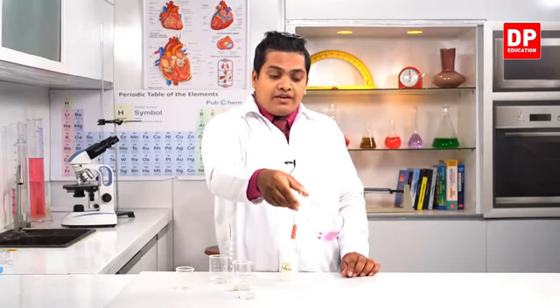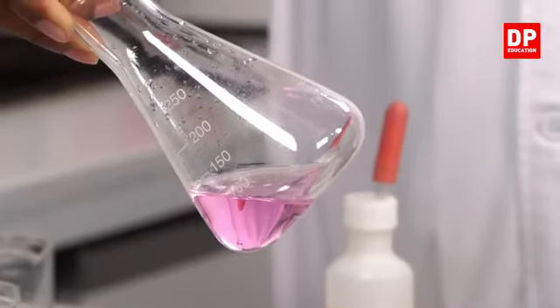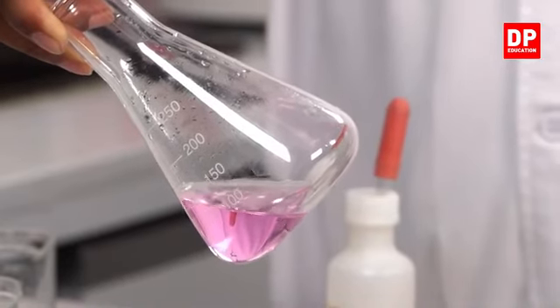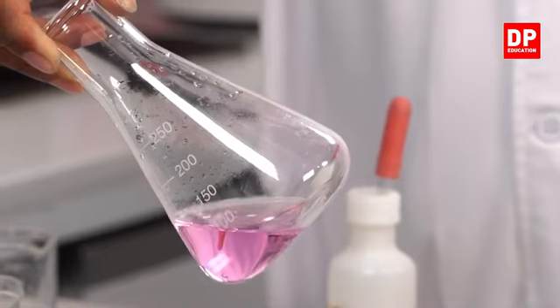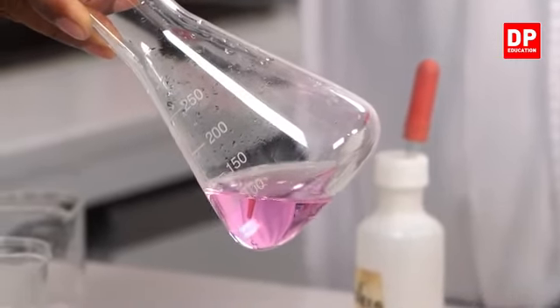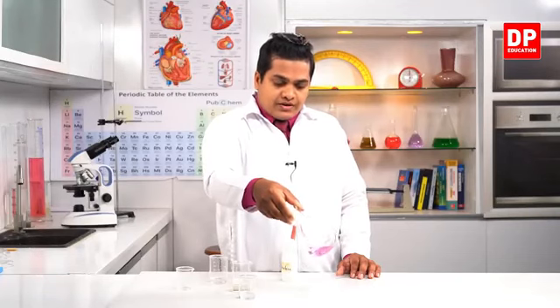So it doesn't have any basic or acidic features when I add HCl or other acidic substances to the sodium hydroxide solution. The basic nature of the sodium hydroxide solution gradually reduces. That's why the pink color is also getting reduced gradually, right?